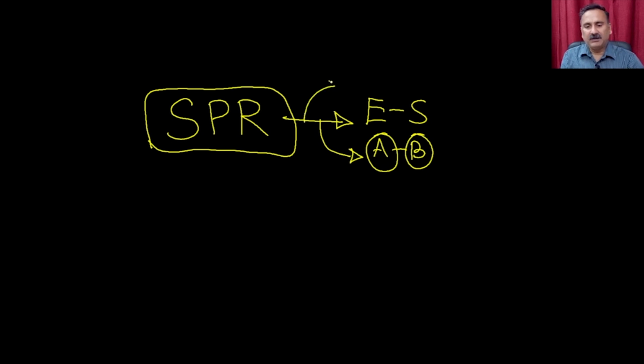For SPR, the system utilizes the pure enzyme and pure substrate. Okay, so you cannot use multiple substrates in a single reaction, but you can measure any kind of interaction. So it works with pure enzyme and substrate combinations.